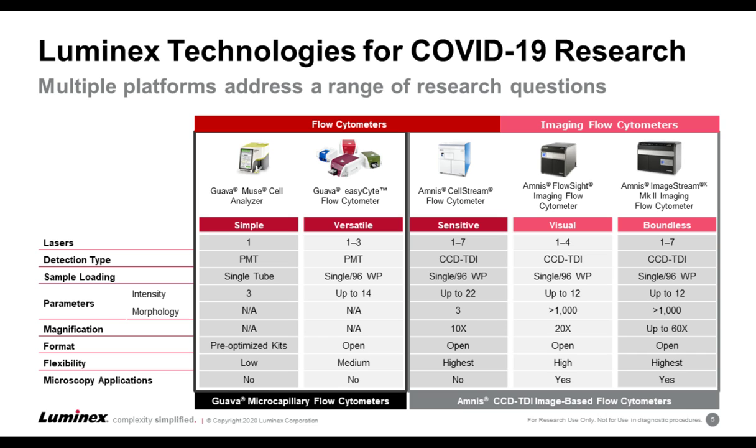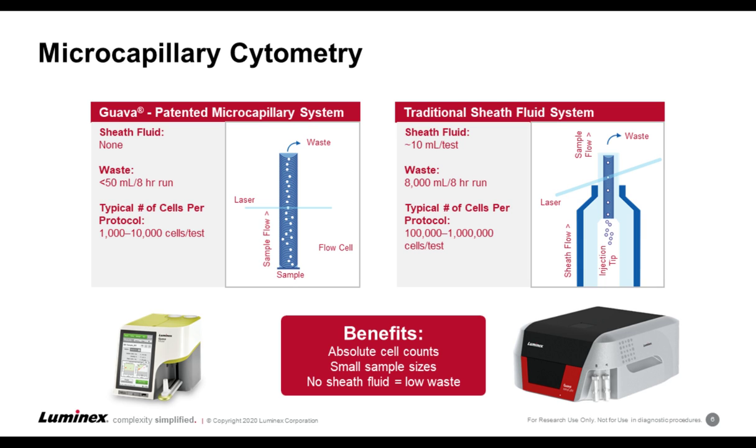During this talk, I will be mainly focusing on microcapillary flow cytometry, and my colleague, Dr. Haley Pugsley, will discuss imaging flow cytometry. So let's first take a look at what we mean by microcapillary cytometry.